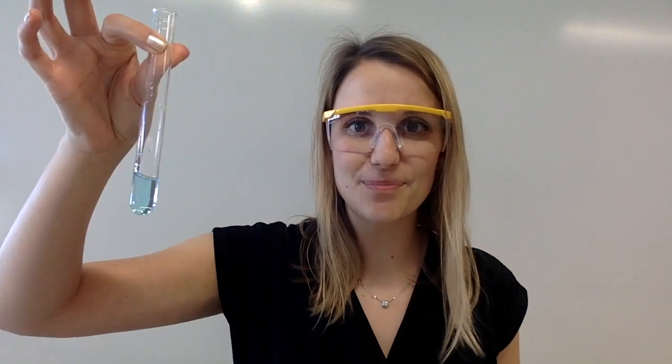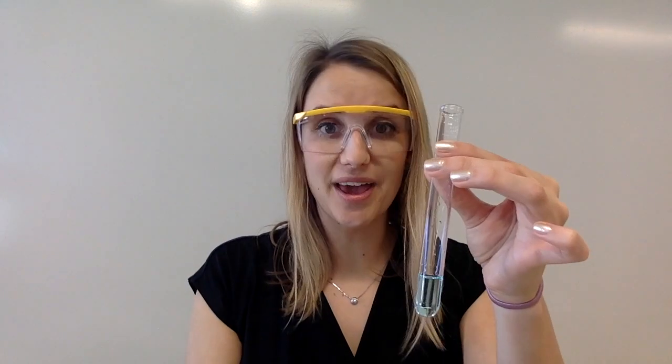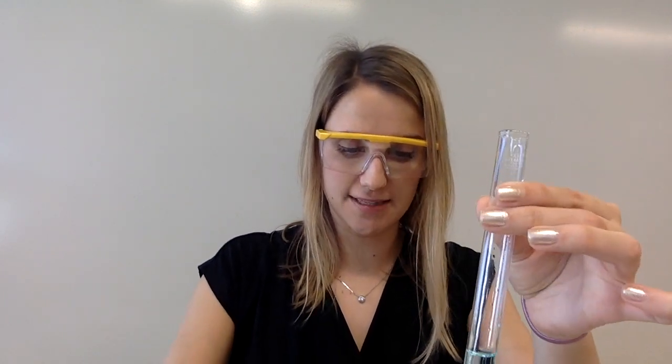Right, so with the other sample we're going to test this one with some ammonia. So let's have a look at what happens here.